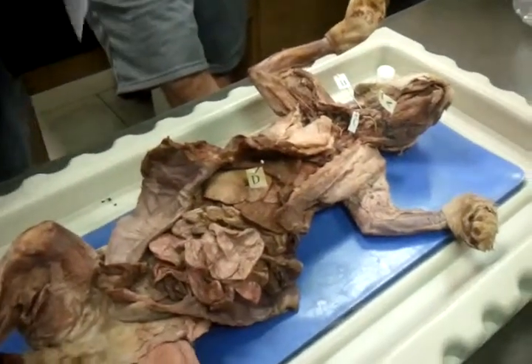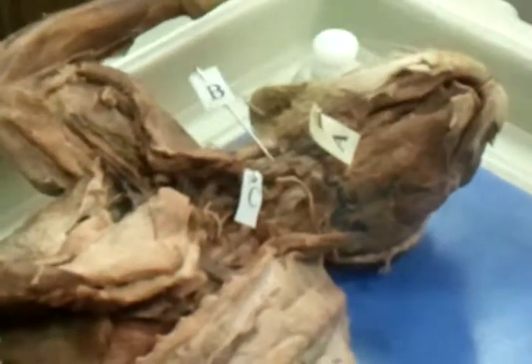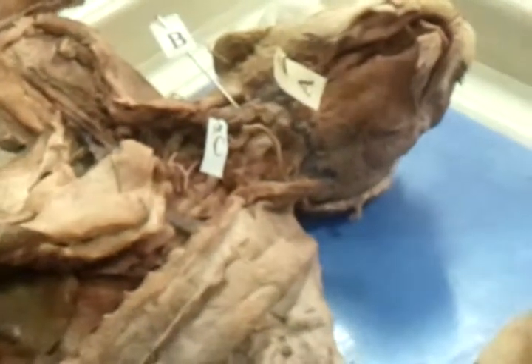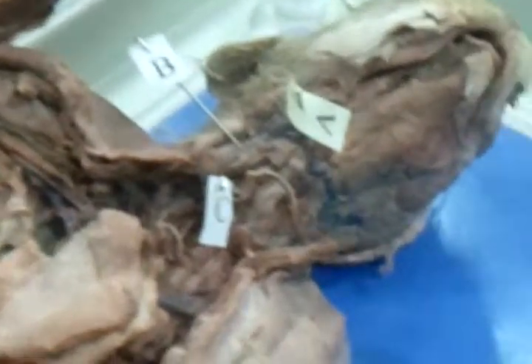Probably not going to try to do any of the internal ones, because a lot of the problem with some of these small ones is that while we're dissecting, we tear the latex so it looks like it's all branching off and it gets very difficult. So if I do any of the ones in the arm, it's going to be obvious ones, okay? There won't be any question about it.